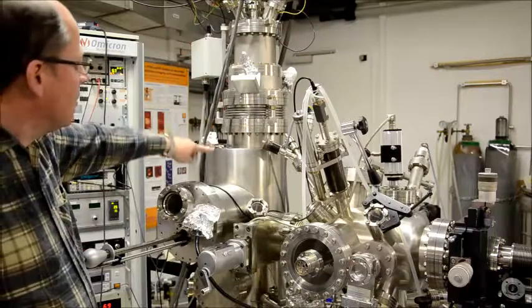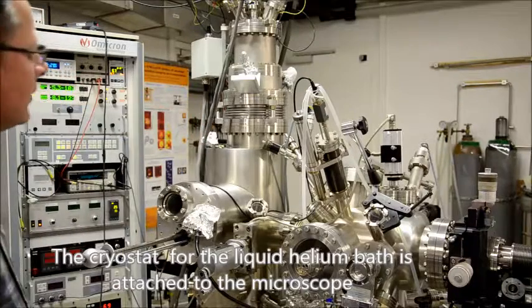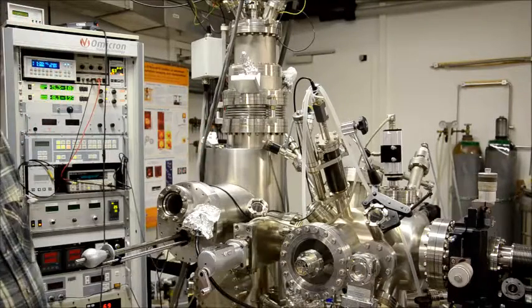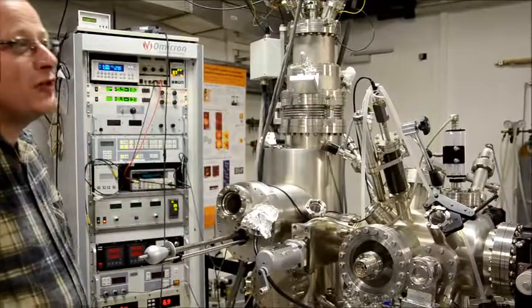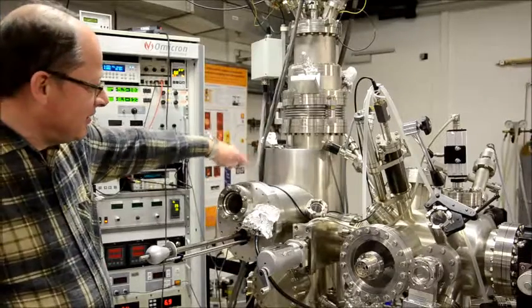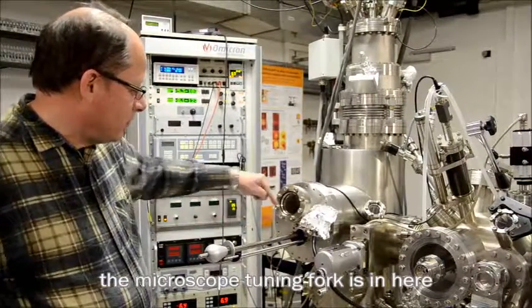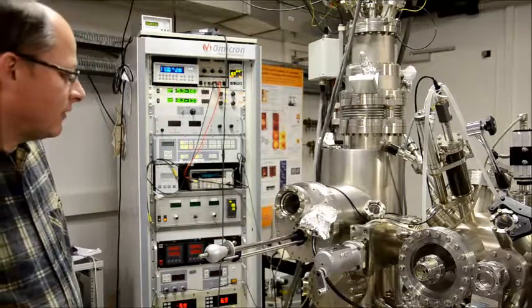And this part here is actually the cryostat, which means you have this liquid helium bath, and attached to that you have the microscope. The microscope itself is not visible at the moment because it's measuring, so I will not touch it. But it's in here. So the tuning fork is in this part. You can manipulate it with this one, and there's also some optical access from the side.